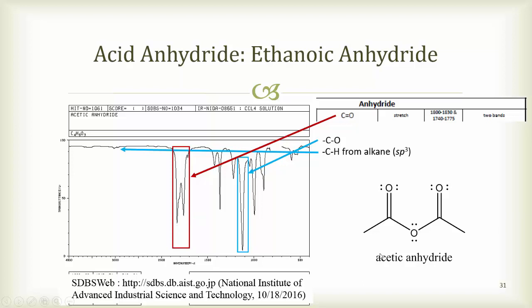You're also going to be looking for that carbon-oxygen single bond in the fingerprint region, which may or may not be real visible to you. And again, it shows up usually around 1000 to 1300-ish wave numbers, but it's usually pretty intense. This one you should be able to see carbon-hydrogen sp3s, but they're almost non-existent. They are still below 3,000. And just because you should expect to see it doesn't mean you're going to see it. Intensities vary, so don't worry too much if that transmittance intensity is less than what you expect it to be.